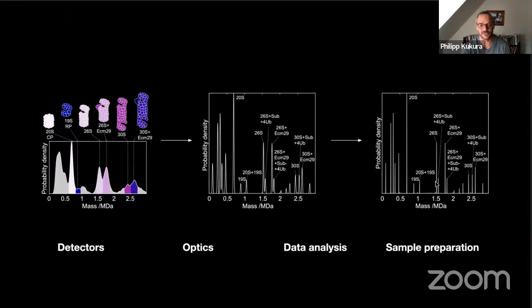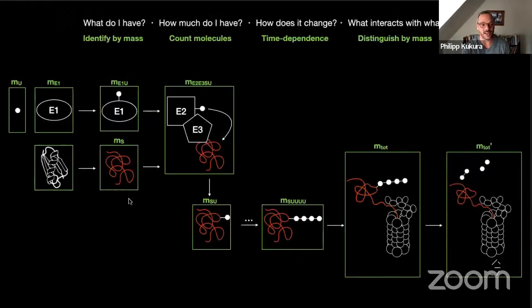Okay, this is 10 kilodalton. So at 1 kilodalton, you could have really complex mixtures. You can identify all of the species. You can see how they change as a function of time. And if you can do that, then you are really in a position where you can essentially just look at biomolecular mechanisms in real time, because you can tell what you have.